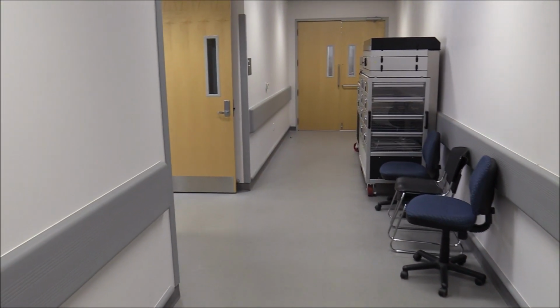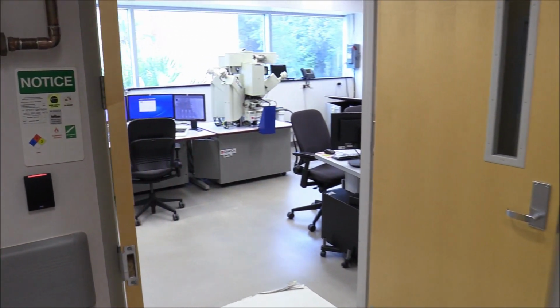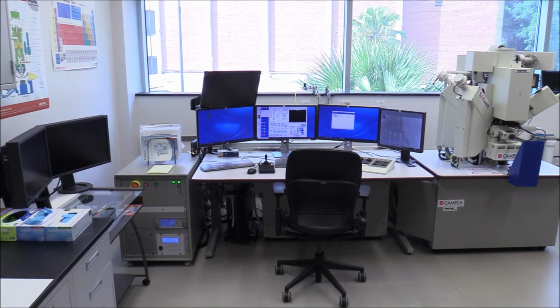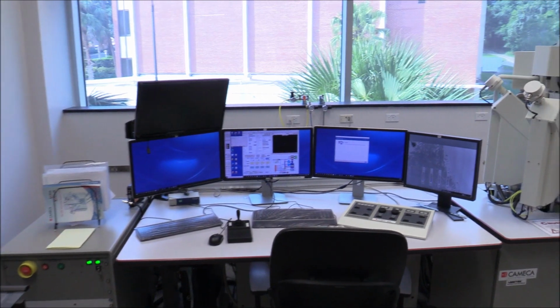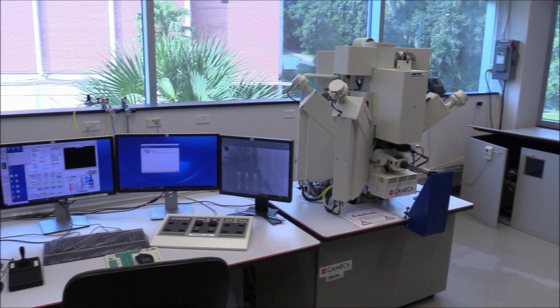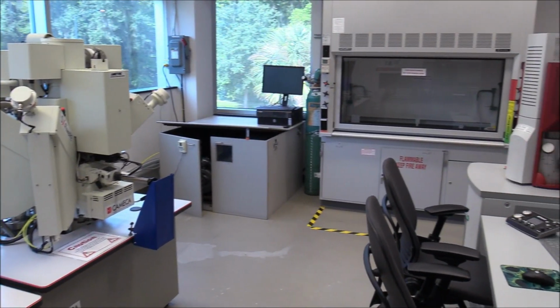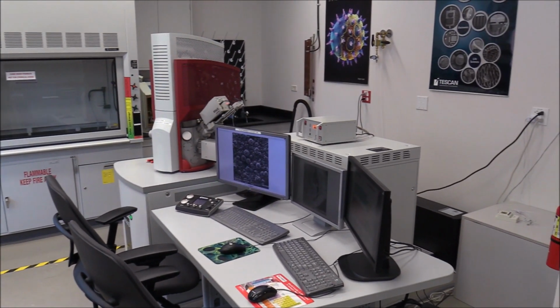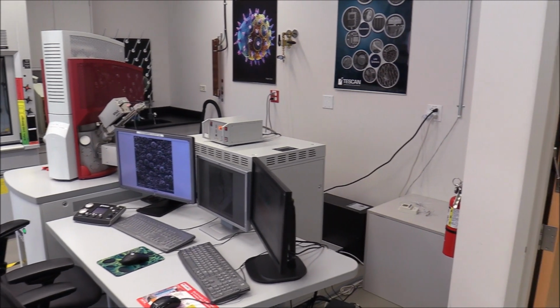An electron probe microanalyzer, or EPMA for short, is an analytical tool used to non-destructively determine the chemical composition of small volumes of solid materials. Concentration of elements from lithium to plutonium may be measured at levels as low as 100 parts per million. Next up is the Tescan Mira3 scanning electron microscope, which is equipped with EDS for elemental analysis and an electron backscatter diffraction detector for crystallographic analysis.